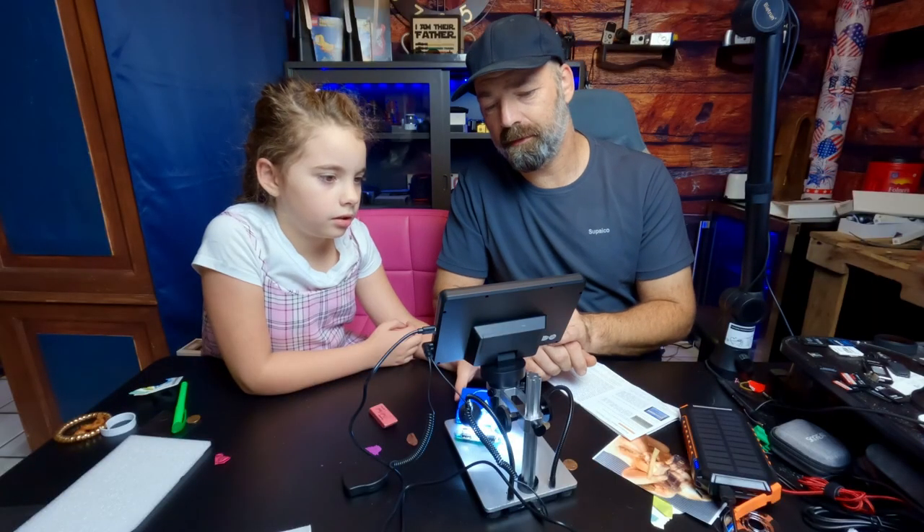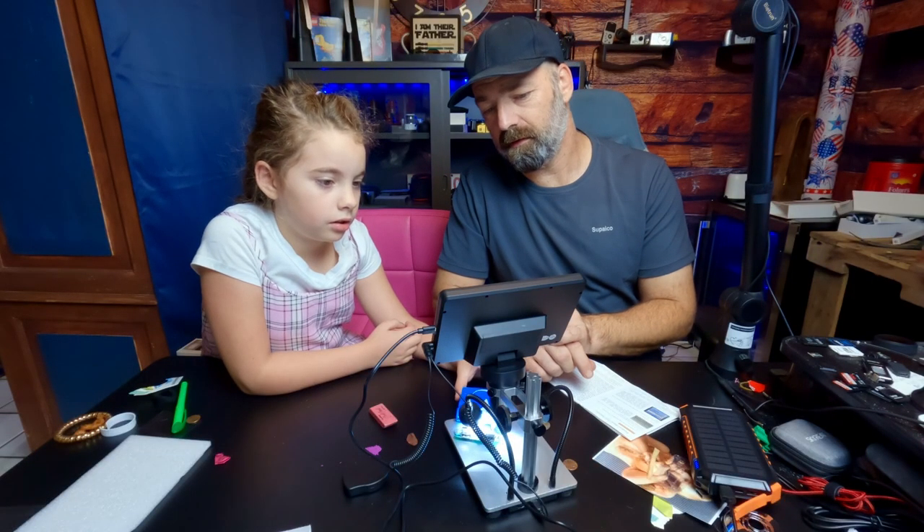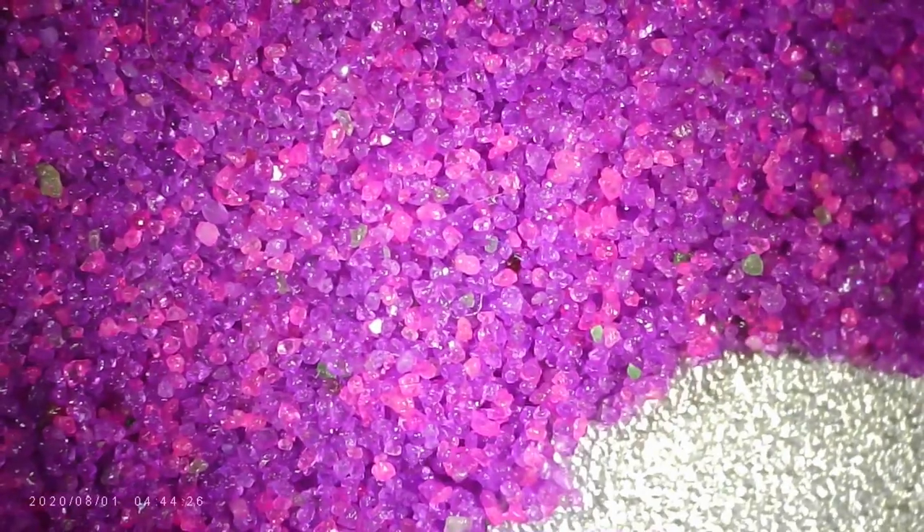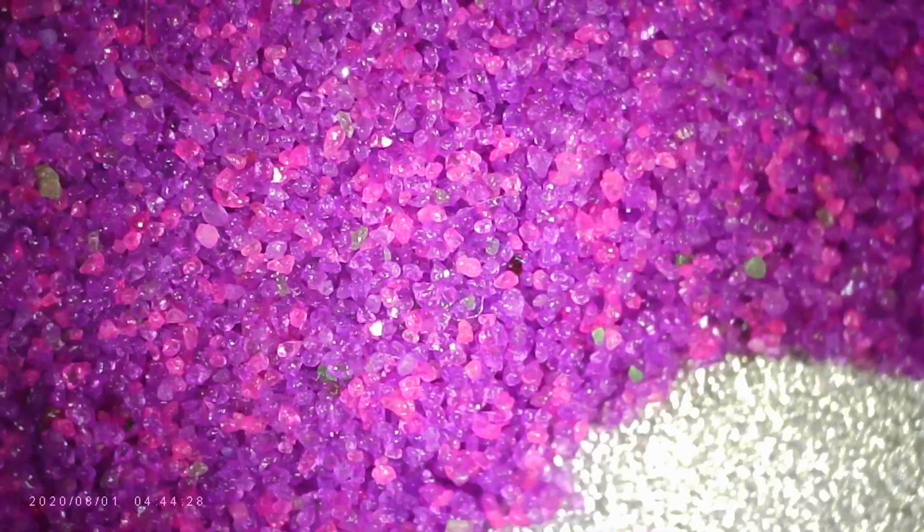You can look at bugs — we even saw some tiny little bugs in some water, but it wouldn't come out on the video. You can check diamonds to see if they're real, or to inspect jewelry. You can also look up close at the plant world, which is really cool, or look at kinetic sand to use as a cool backdrop on your phone or iPad.